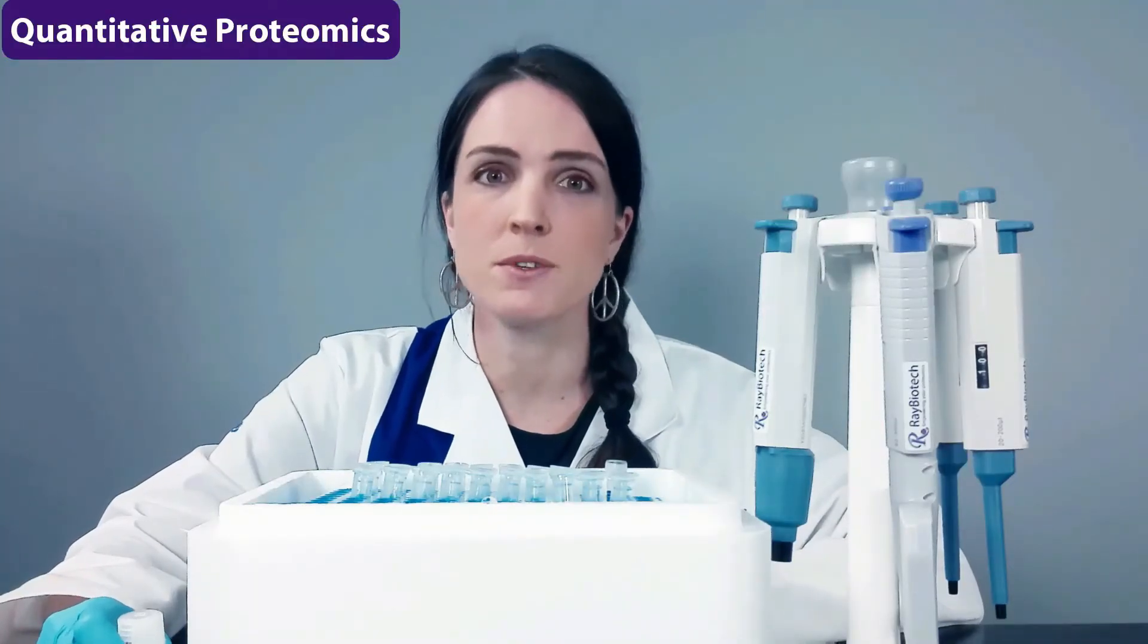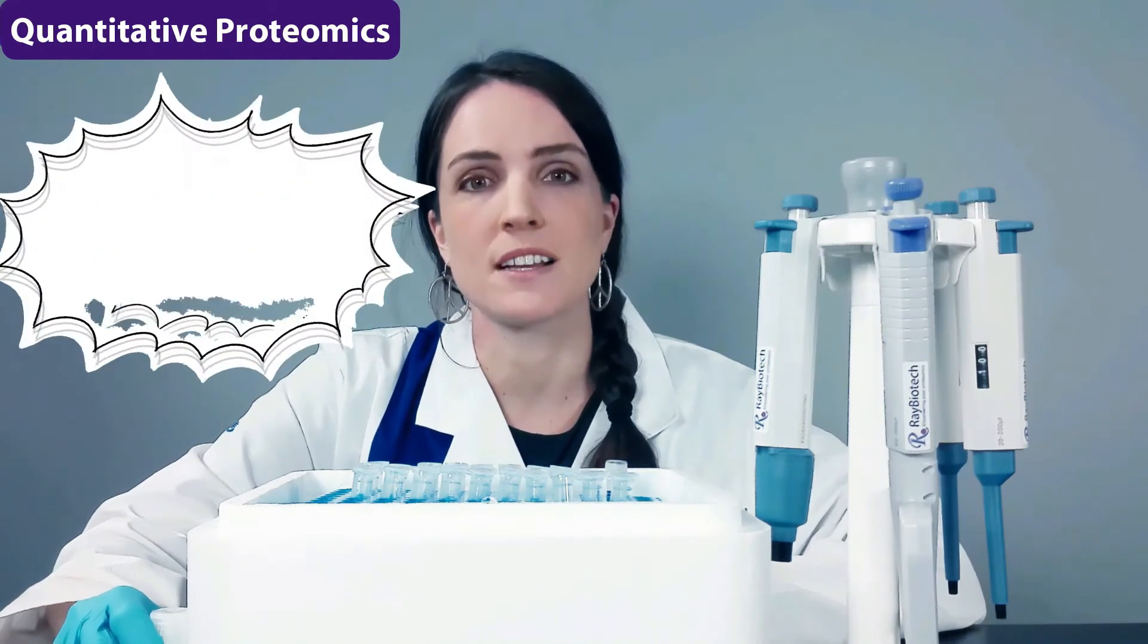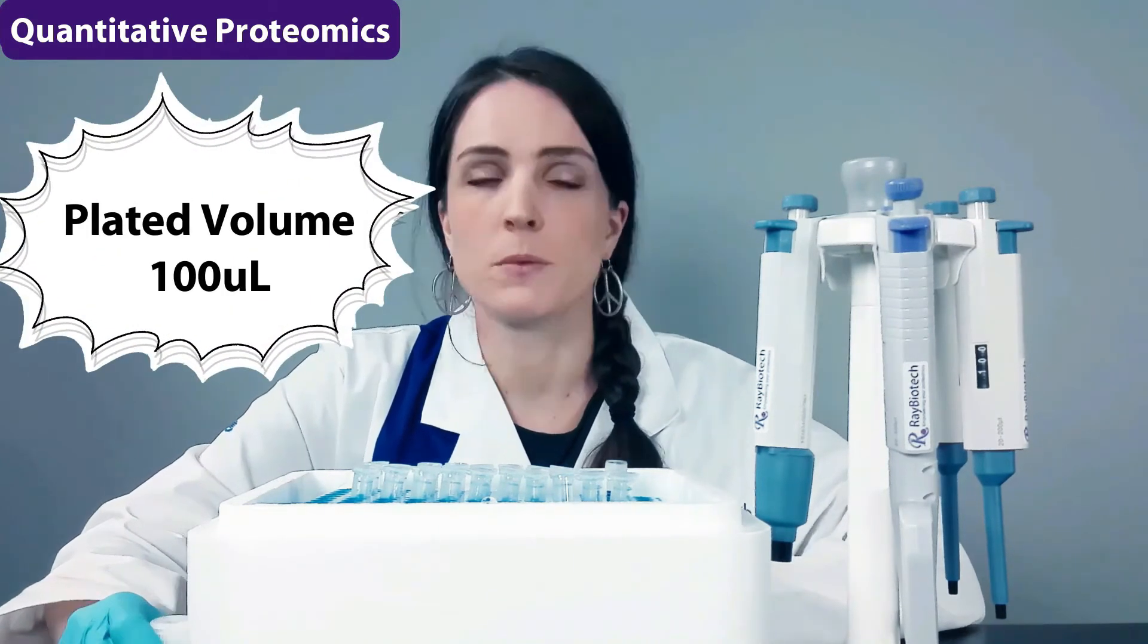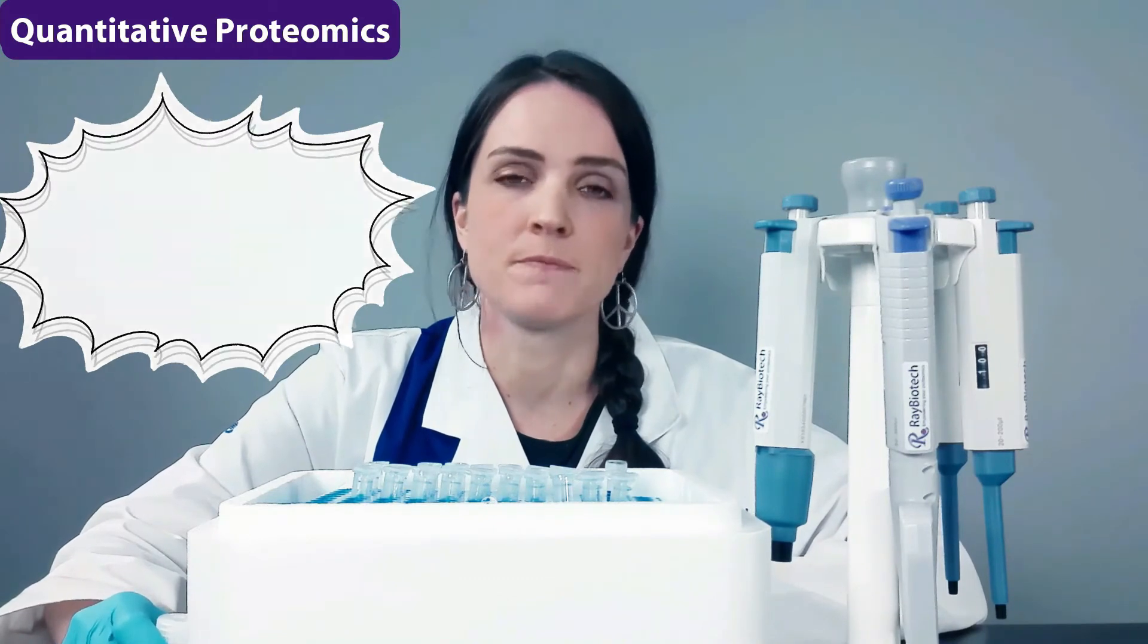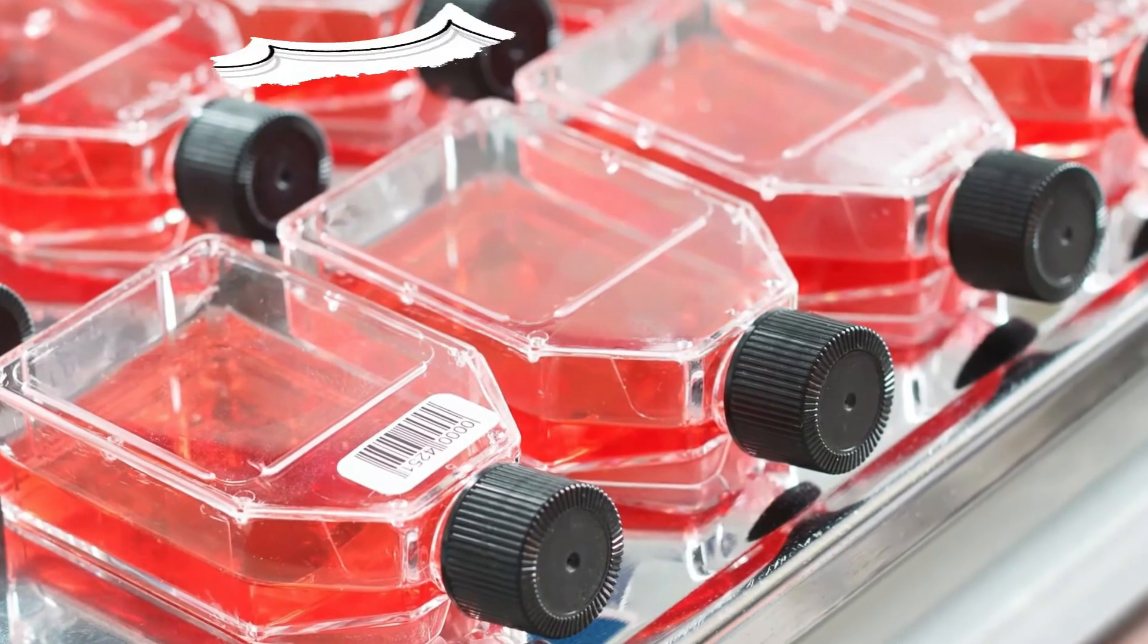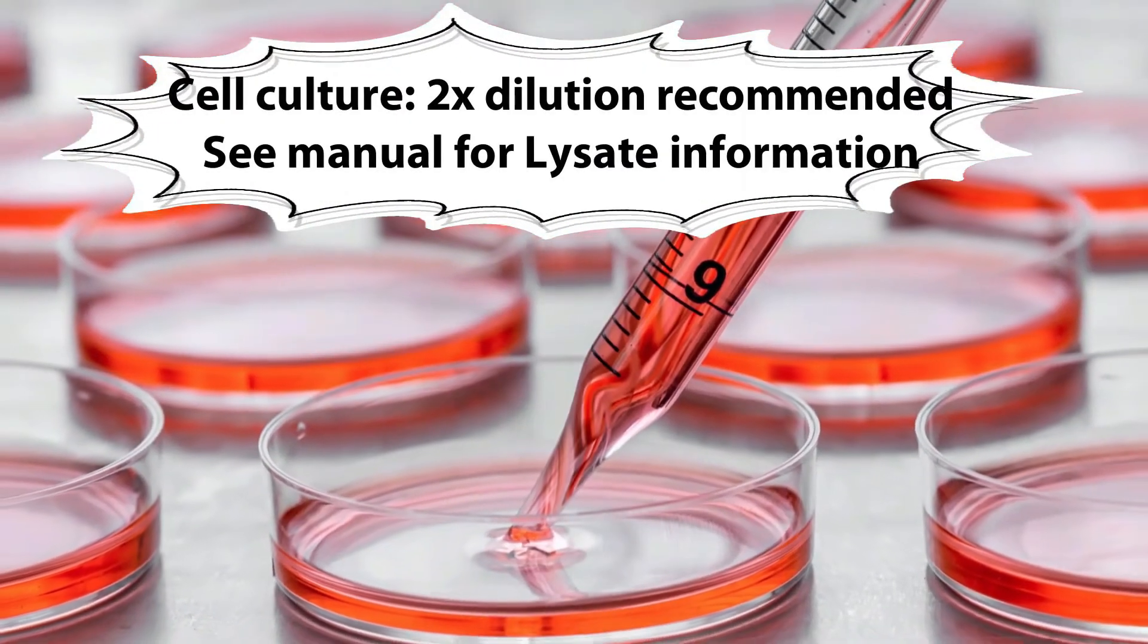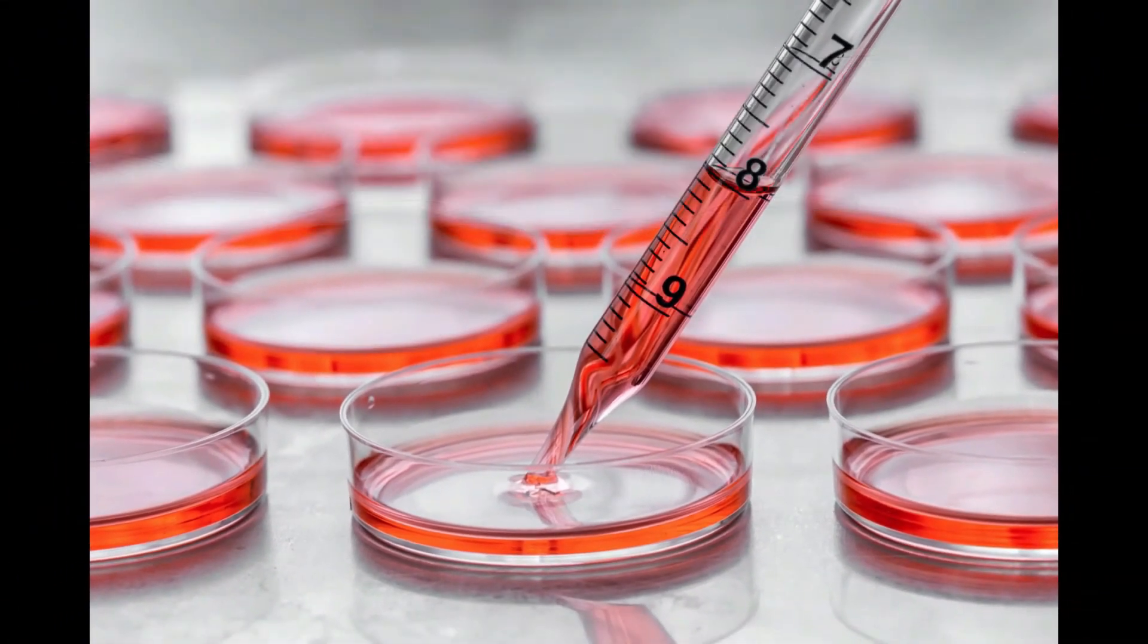Now remember when it comes to your samples, you never want to use an undiluted sample. That's because we want to minimize external matrix effects. With serum and plasma, that's really easy. We just recommend a 2x dilution. With cell culture samples, use serum-free conditioned media if possible. If serum-containing conditioned media is required, it's highly recommended that complete medium is used as a control, as many sera contain cytokines.